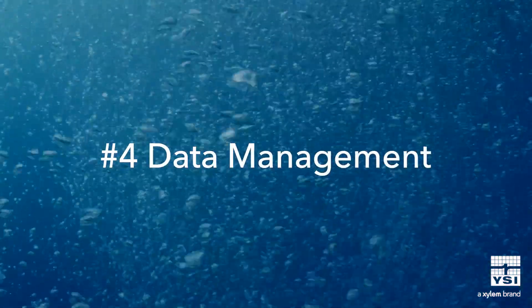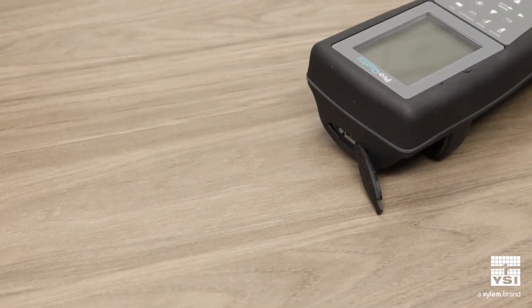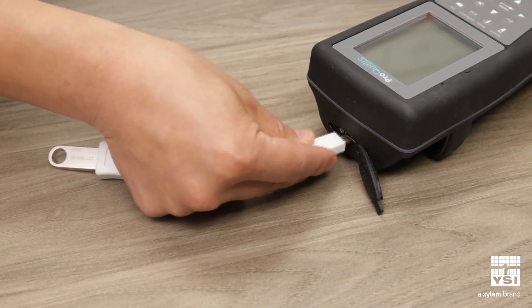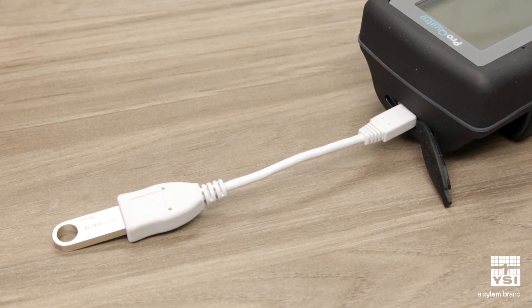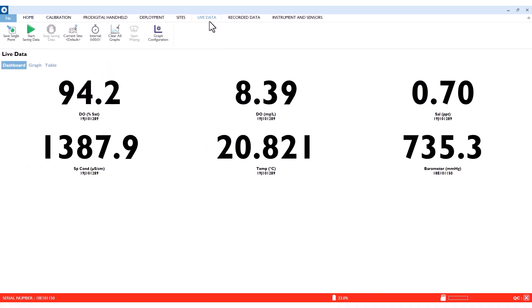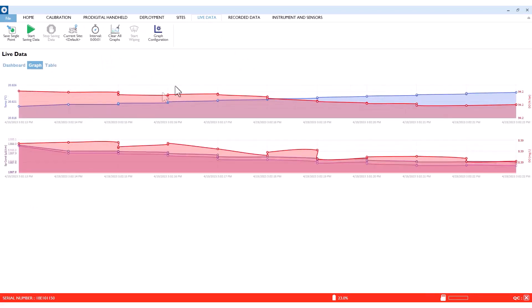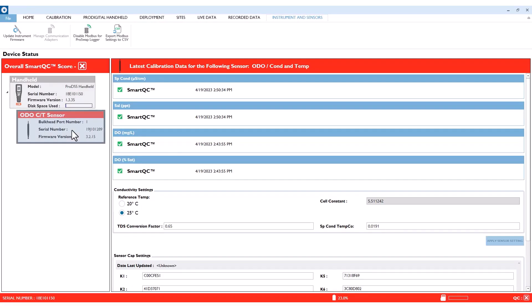The fourth thing to consider is what kind of data storage or management you need for your application. The ProQuattro has increased data storage compared to the ProBasic handhelds and a USB port for data download and software upgrades. The ProSolo, ProSwap, and ProDSS have even larger onboard data memory, and the ProSwap and ProDSS also have optional GPS capabilities. The ProSolo, ProSwap, and ProDSS all interface with Core software, a unique data management tool to view live data, import and export your data, calibrate sensors, and manage settings.